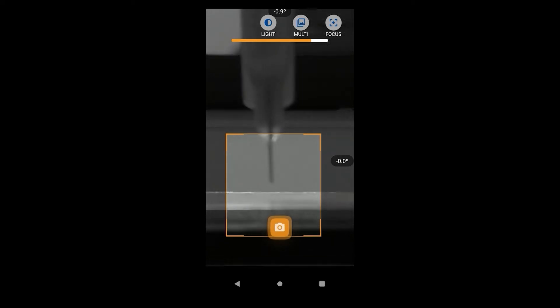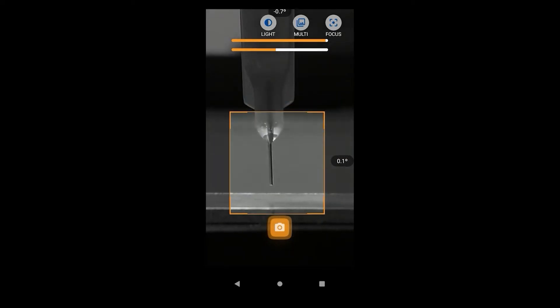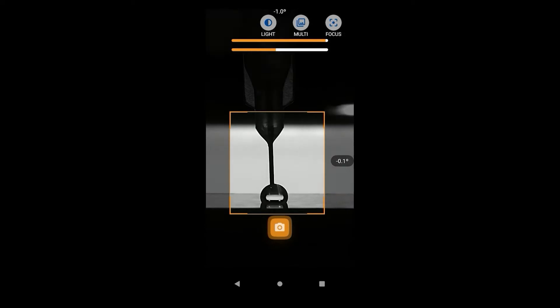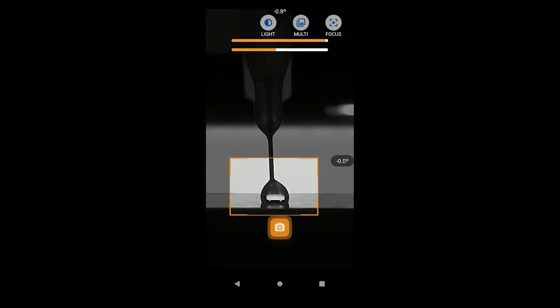We manipulate the orange box to select the area of interest. Use the focus slider to focus on the droplet. To get the best results, the focus slider should ideally be as close to the maximum value possible — the aim is to be as close to the droplet as possible without losing focus. Adjust the LED backlight and the phone's light to get the best possible contrast between the droplet and the background.